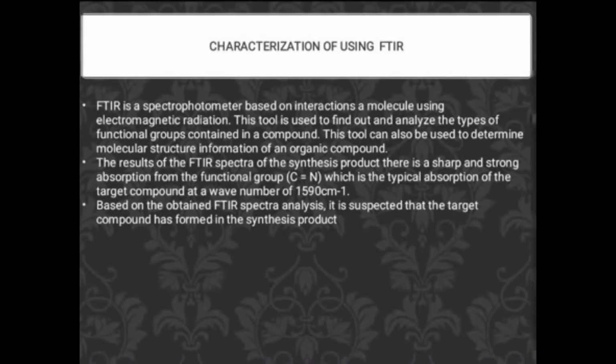Okay, I am Izadul Ilmiah. I will explain about characterization using FTIR. FTIR is a spectrophotometer based on the interaction of a molecule with electromagnetic radiation. This tool is used to find out and analyze the type of functional group contained in a compound. This tool can also be used to determine molecular structure information of an organic compound.